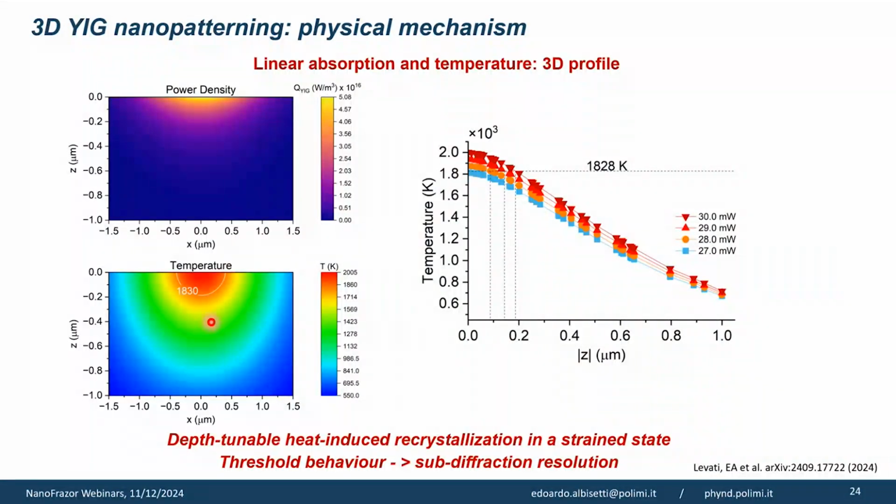So this is a nice way, and I think again that was also seen probably with the NanoFrazor erasing with the PPA, because it is a nice way to achieve subdiffraction limit with transitions that are peaked. Of course, we're working also with materials that do not have such a sharp transition, but have more gradual transition.